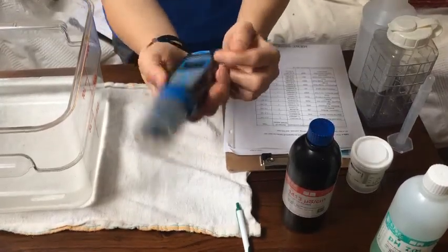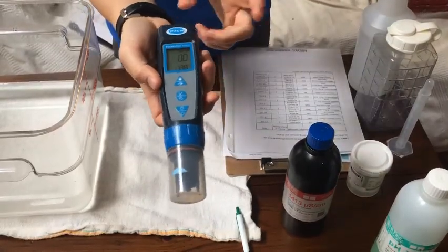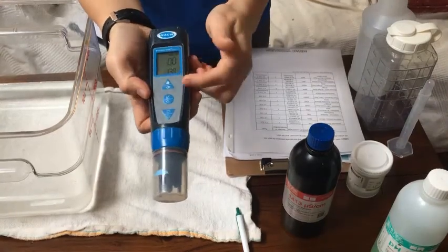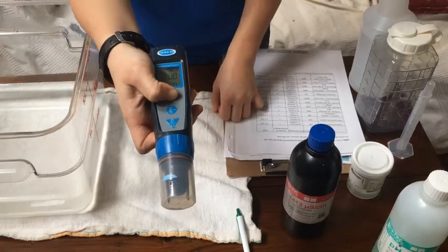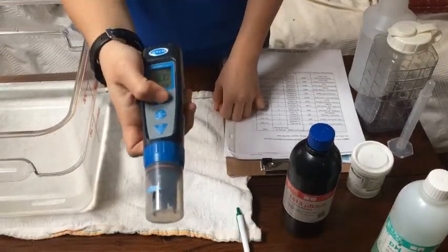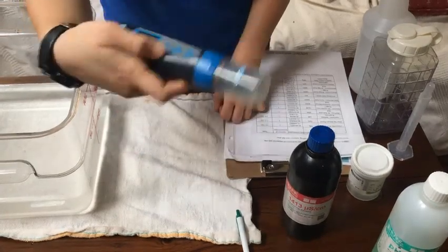Up top you'll see it says TDS — total dissolved solids. In order to switch your parameter, you hit this top button and hold down. This is salinity — keep going. And this is pH, so we'll start with pH.